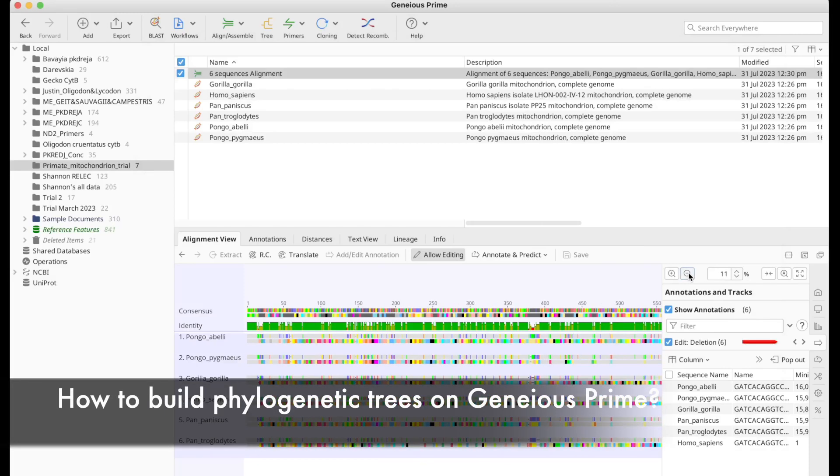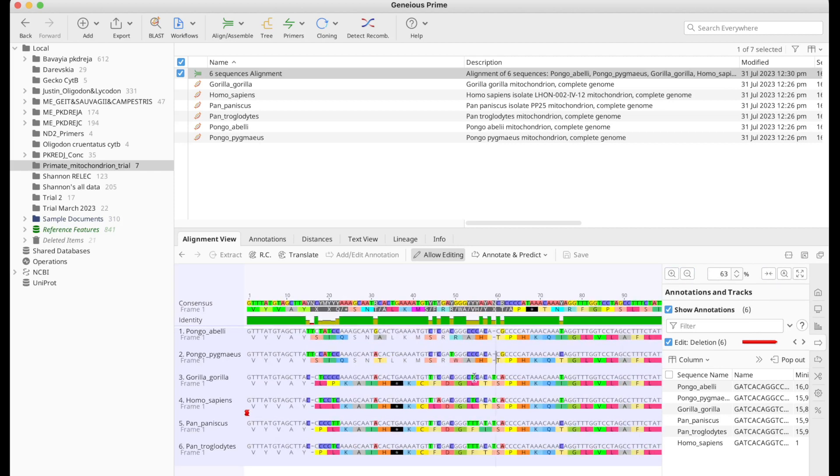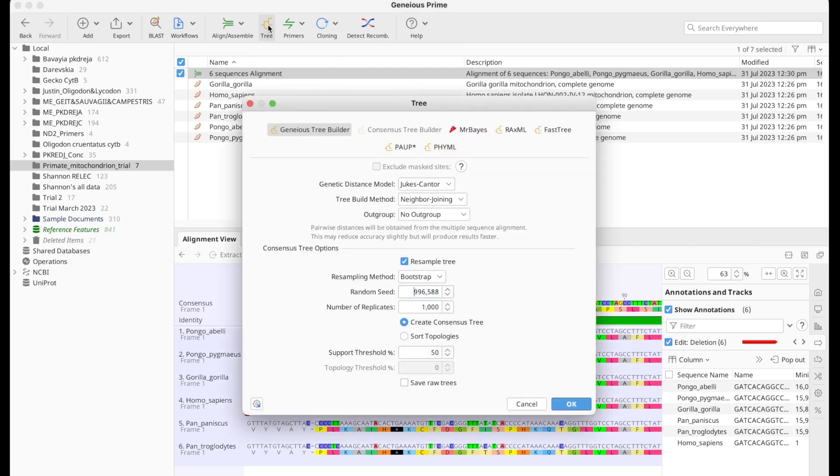Now next step will be creating trees with these alignments. In the previous tutorial, we've already covered how to align sequences. And then next step will be pretty easy, the tree. Just select the sequences aligned and then click on tree.